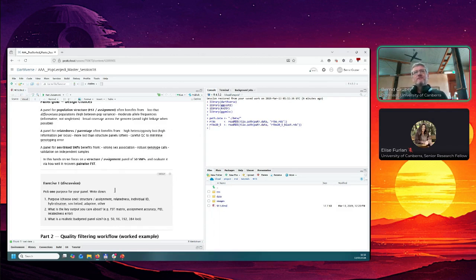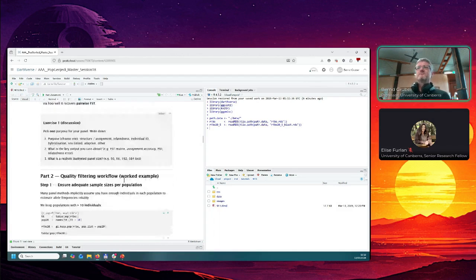You can try to optimize that a little bit and use the sex-linked function to see how good it is at predicting the sexes, then subsample your panel and make it more difficult or less difficult in terms of the number of sex-linked markers you use. But you don't need many sex-linked markers, because the moment you have 5 that are linked to a female and they are reliable, that's more important, you can basically identify the sex. Correct? Pretend she's nodding. Okay.